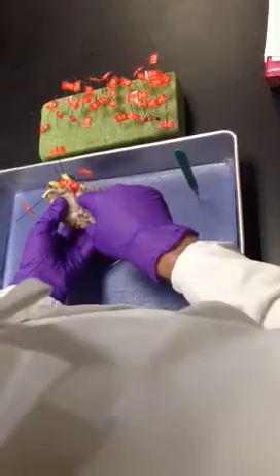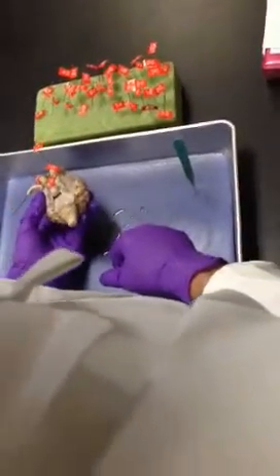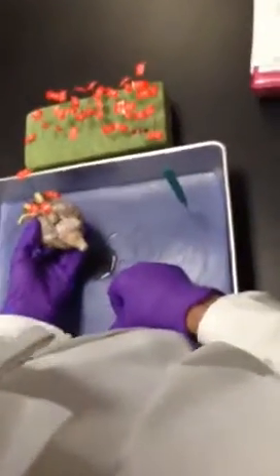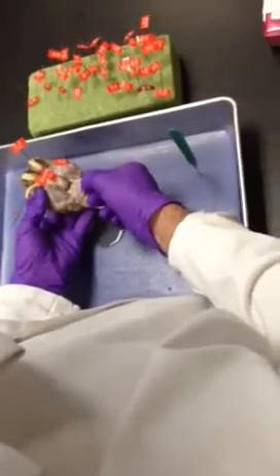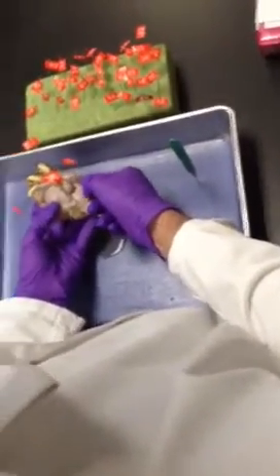Then we go ventral. Number 15 is the pituitary gland. Pretty good size, and it covers a lot. Here's your dura mater. You can tell it's real tough, and it's the outer covering.